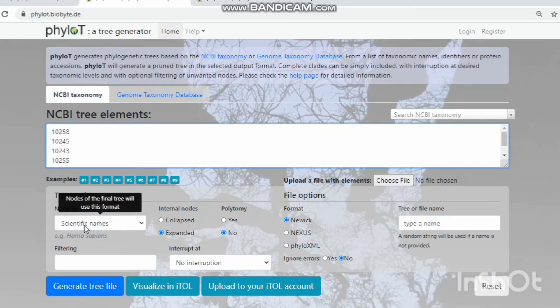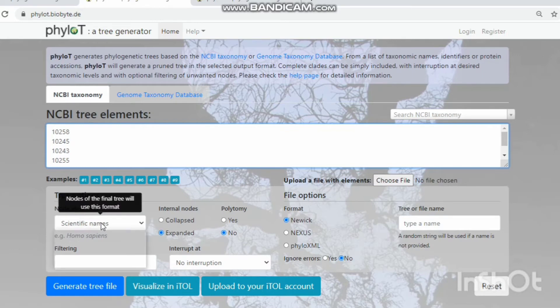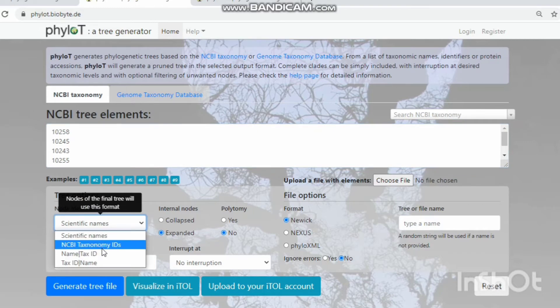The node identifier has four types: scientific name, NCBI taxonomic ID, name and ID, and ID and name.